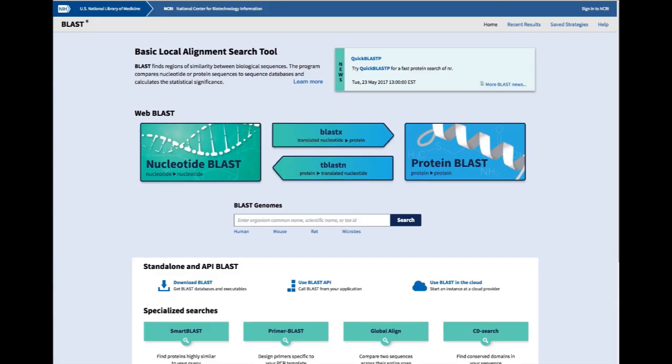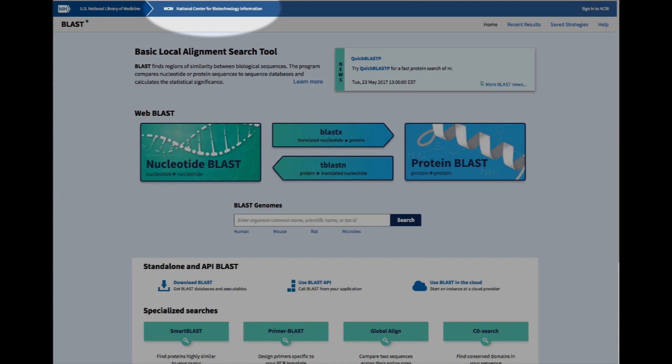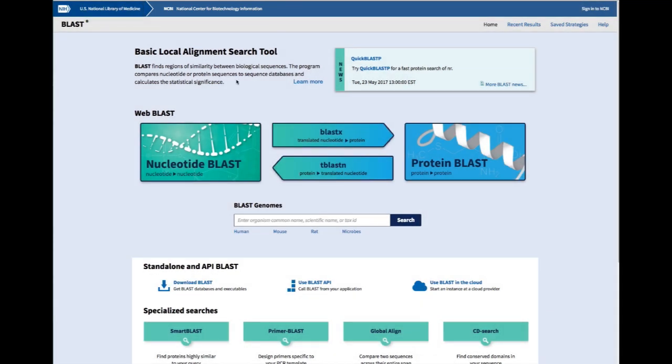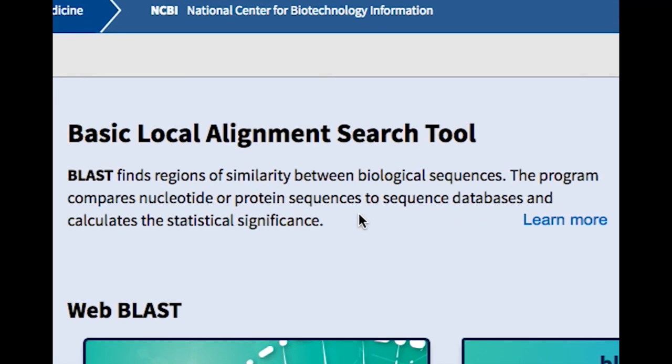We can compare the assembled sequence to sequences of other 16S ribosomal RNA genes in the GenBank database. We can use a program known as BLAST, which stands for Basic Local Alignment Search Tool. You can access BLAST from a number of computer servers in different countries. We will use the server of the NCBI, National Center of Biotechnology Information, at the US Library of Medicine. As it says on the webpage, the program compares nucleotide or protein sequences to sequence databases and calculates statistical significance. The NCBI website contains more information and tutorials about BLAST, which you should explore.